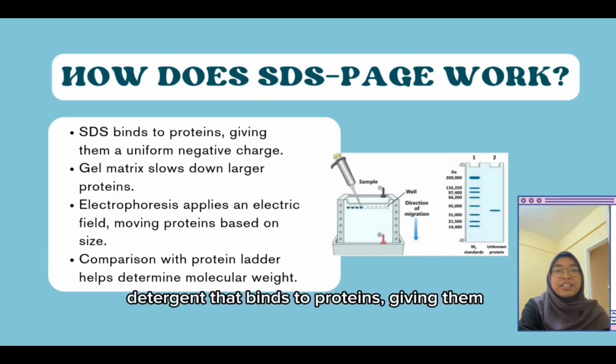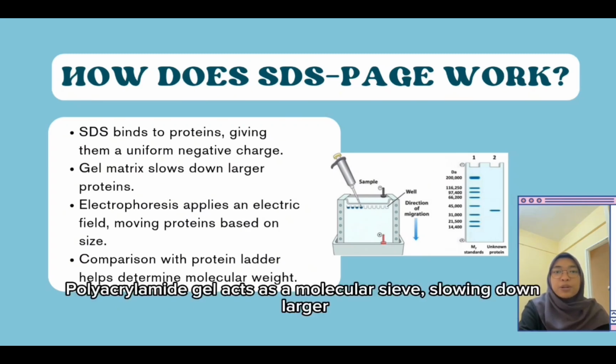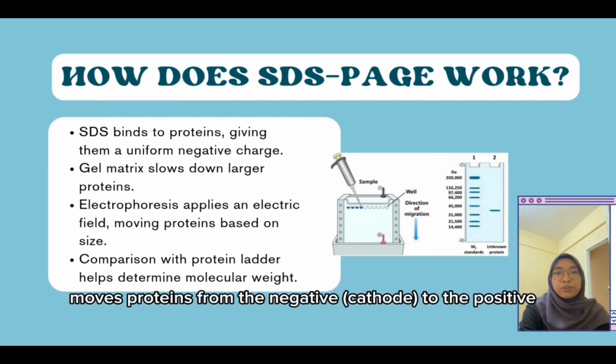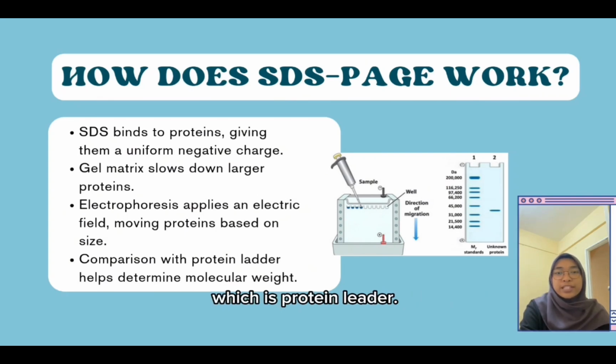SDS is an anionic detergent that binds to proteins, giving them a uniform negative charge. This eliminates differences due to protein shape or charge, allowing size-based separation. Polyacrylamide gel acts as a molecular sieve, slowing down larger proteins while smaller proteins move more easily. The electric field moves proteins from the negative cathode to the positive anode. Protein size can be compared to a molecular weight marker, which is a protein ladder.